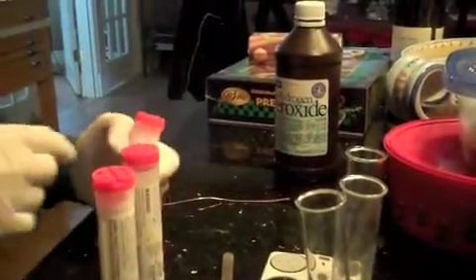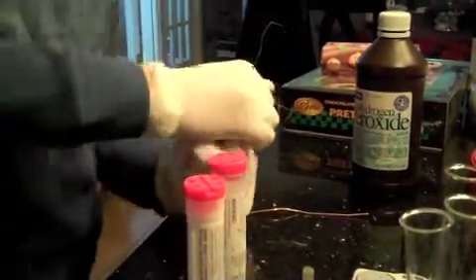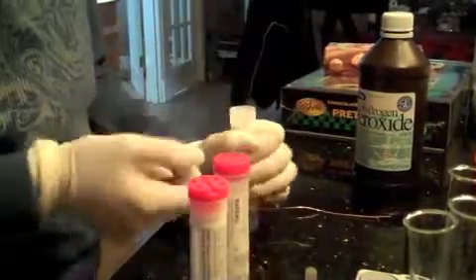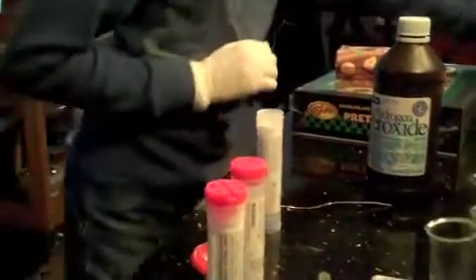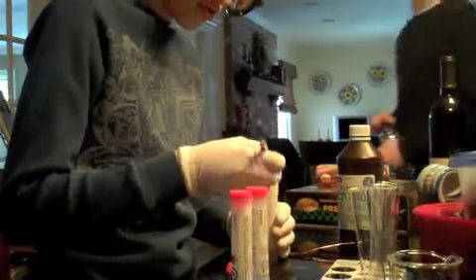So what you're supposed to do is take the sodium carbonate. As you can see, I'm wearing proper safety things. Two water spoonfuls — forgot to put water in this.